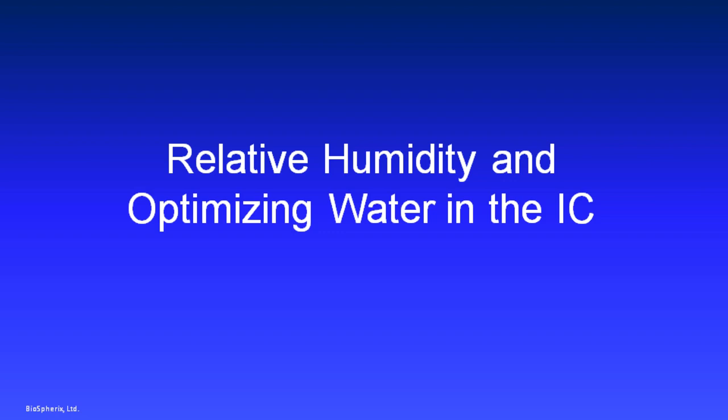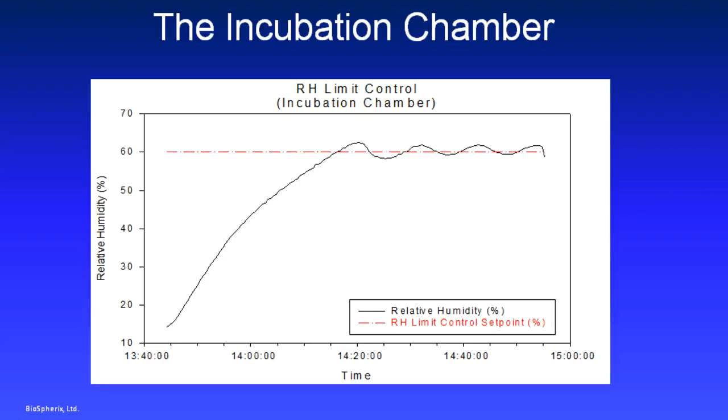So with all the data that you're gathering from the Xvivo system sensors around your process as you practice it, you can also optimize other parameters so you know what to set them to for your process. Now let's talk about relative humidity first. Now the Xvivo system obviously isn't plumbed to your water pipes. It's not adding humidity to the air. The only humidity that it gets in there is from the water you bring into the system and any processing fluids you bring into the system.